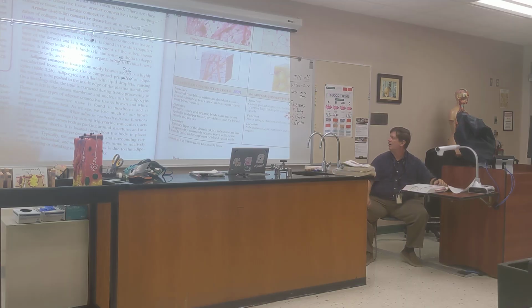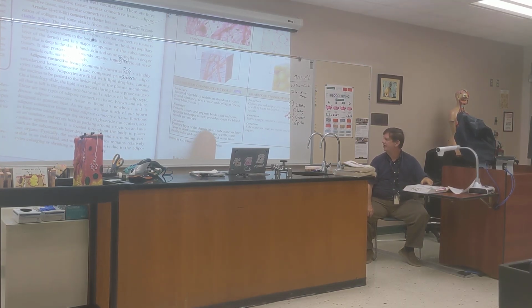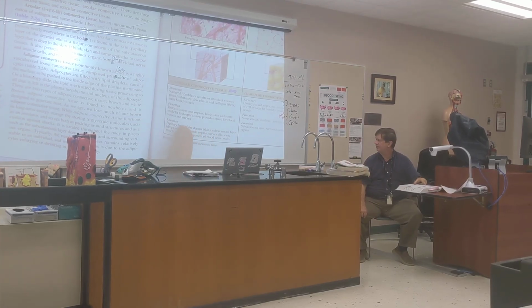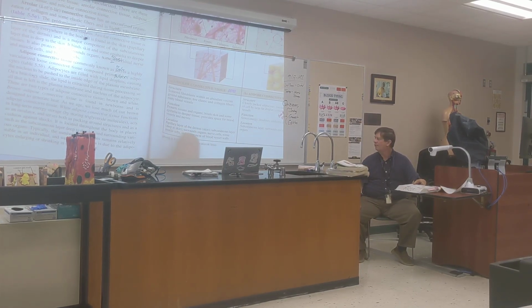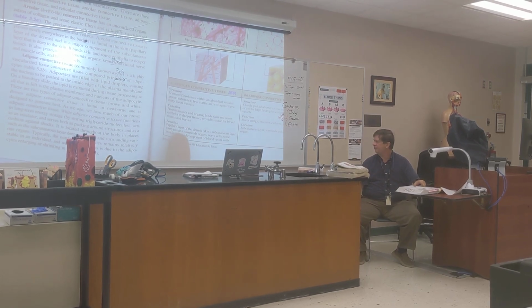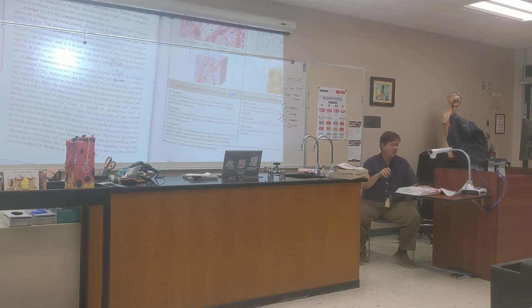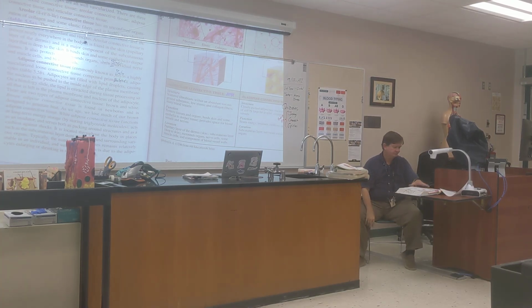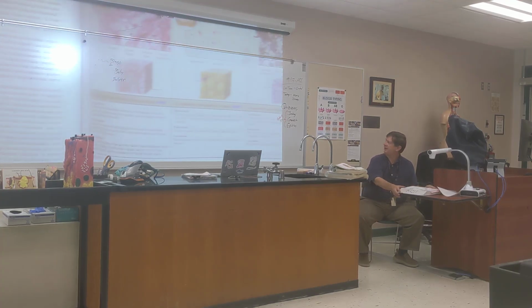Right there. Where is it areolar connective tissue? In the papillary layer of the dermis, the subcutaneous layer deep to the skin, we're talking about that hypodermis area, okay? Around organs, nerve cells, some muscle cells, we have some of this around them just to cushion them, not have things harass and get to them. Does that make sense? All right, so we've got the first of the ones on there, areolar connective tissue. The next one is the adipose tissue, and that's the next picture.